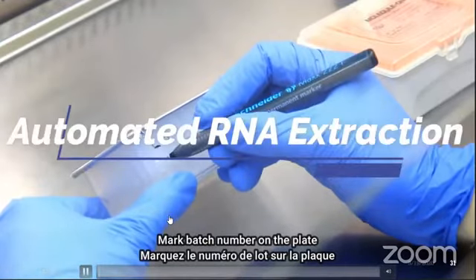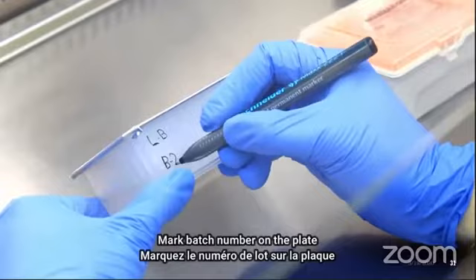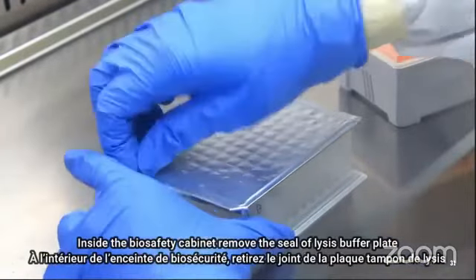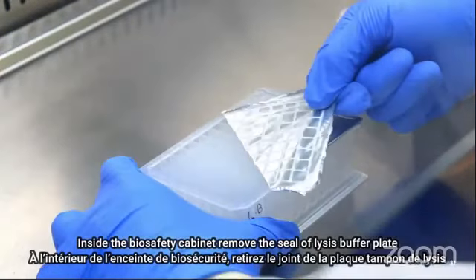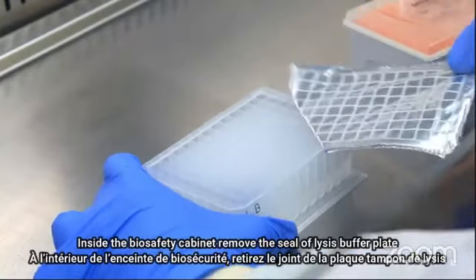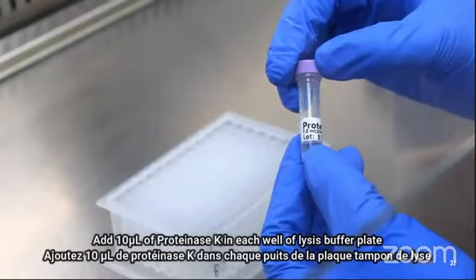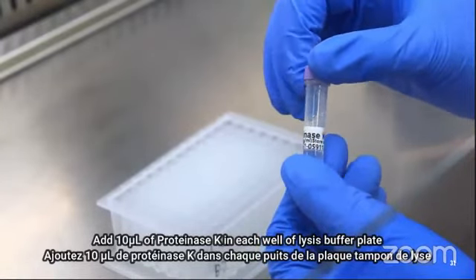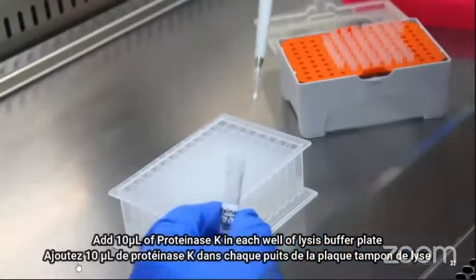This is the deep well plate. Inside the biosafety cabinet, remove the seal of the lysis buffer plate. This deep well plate contains the lysis buffer. After this, add 10 microliter of proteinase K into each well.